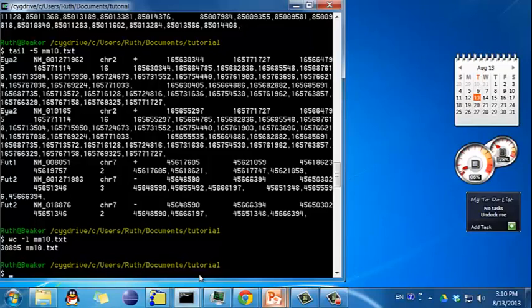The last thing I want to show is the grep command. It's extremely handy to handle simple text files. For example, in this genome annotation file, each line contains a transcript. Therefore, for a single gene, multiple lines exist if it has more than one transcript. Now I want to see all transcripts for BRCA1.